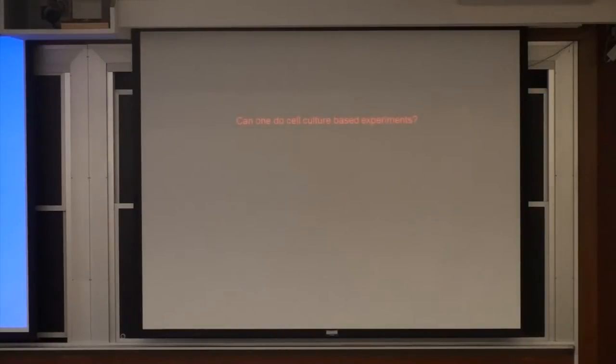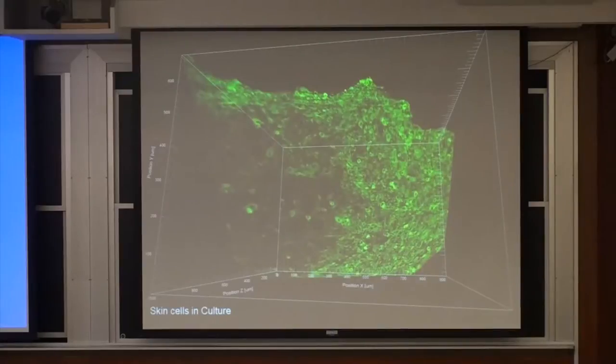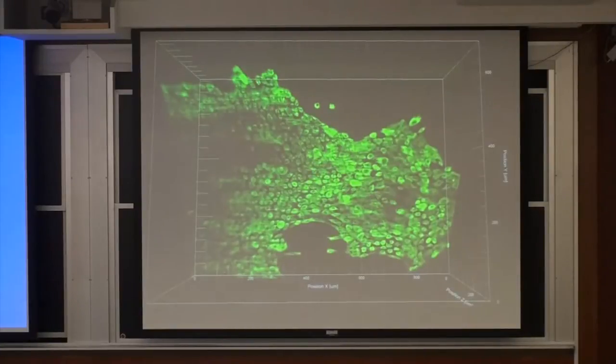I will come to that point. Before that, I also want to show that this method is not only applicable for this animal model. I also tried some experiments with cells in culture, in 3D culture. There also you can see the individual cells in culture, and it is a cytoplasmic marker.